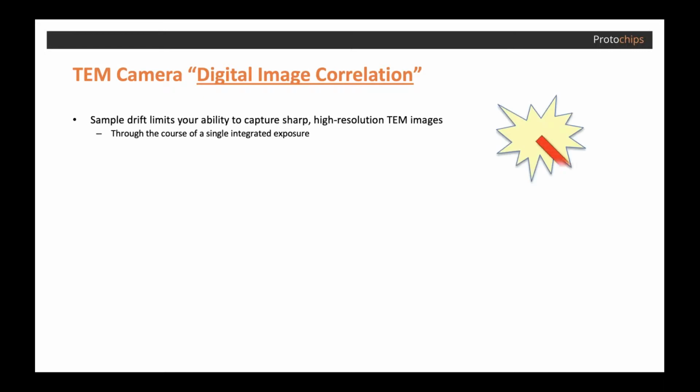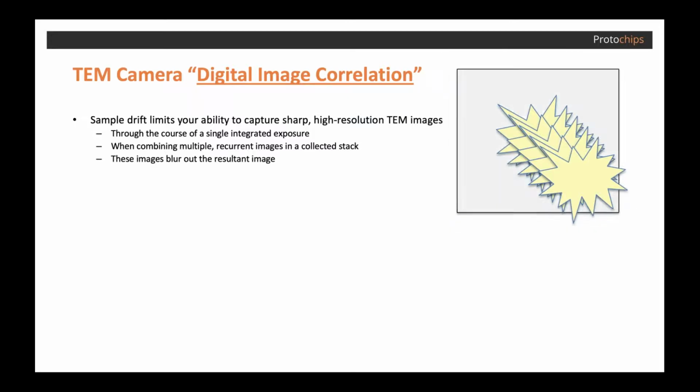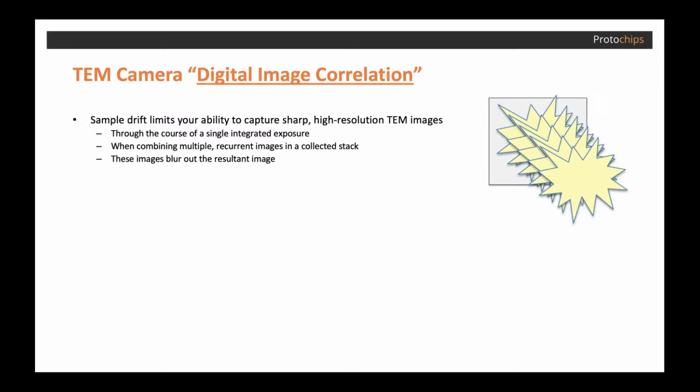So we're all very familiar with the problems induced in your work when the sample drifts. Collecting a sharp, coherent image as your sample moves is frustrating and ultimately limits the best quality or resolution from being recorded. As the sample drifts, the images are misaligned and combine to form something that's blurred or a really confused looking image. Now, depending on the amount of drift and the size of your field of view, you may not be able to record your intended region of interest before the sample moves out of the frame. This may force you to work at magnifications lower than you would prefer.